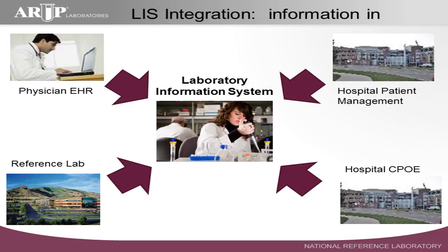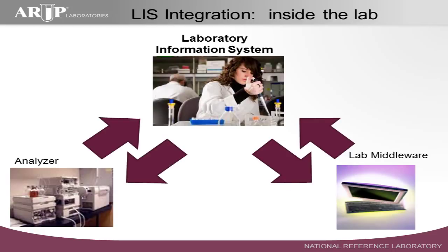And the same with the reference lab. We're pushing results out constantly. As I stand here and speak right now, we have results being pushed out to various lab systems across the country. Integration inside the lab. So you can start to gather from this discussion so far, there is a lot of data integration going on with the laboratory information system. You always need that expertise in an IT group that manages and administers a laboratory information system. Either you have it in your group or you're contracting a lot with your LIS vendor to do this type of data integration, which is what a lot of hospital labs end up doing. They just pay their LIS vendor to do a lot of this.